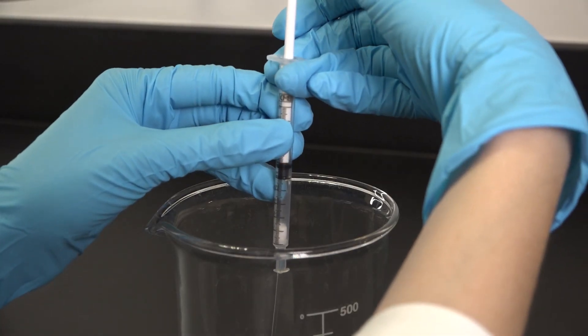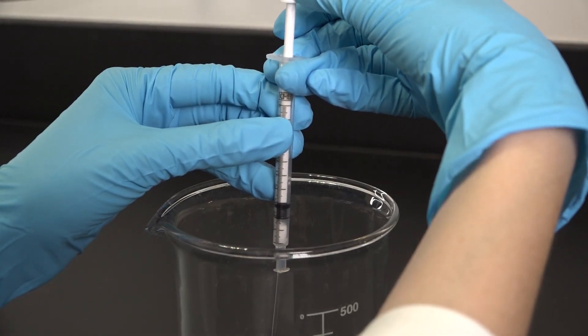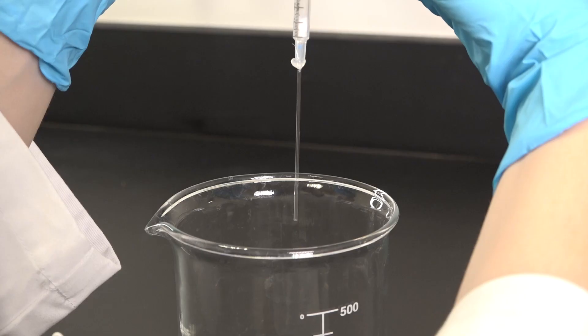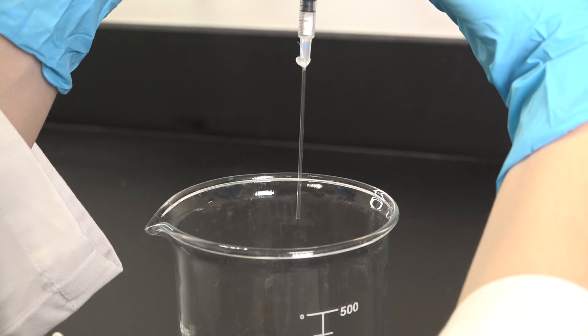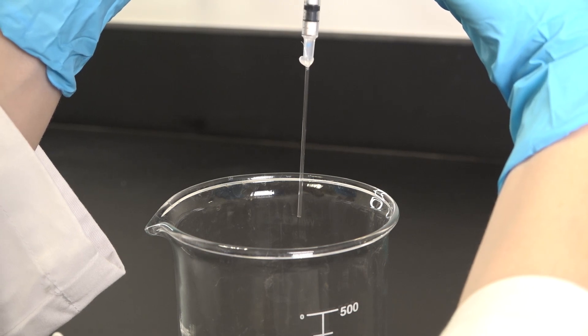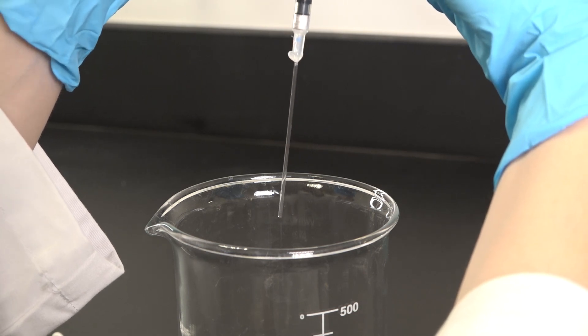Then I'll ever so carefully reinsert the plunger of the syringe. I'm reinserting the plunger over a beaker because there might be a little drop of potassium hydroxide that comes out of the capillary, and we do not want that squirting all over the place.